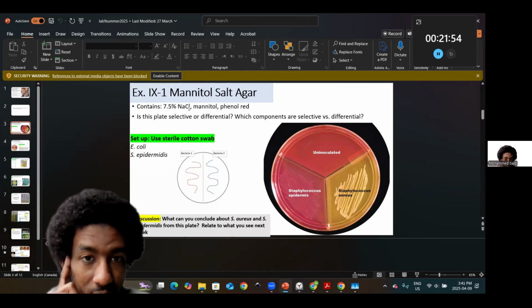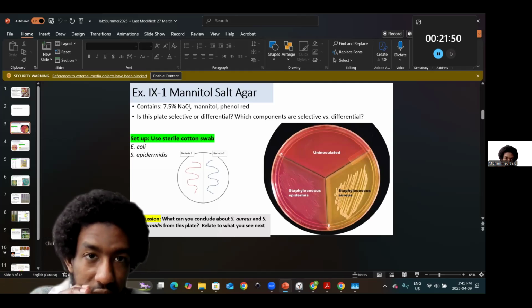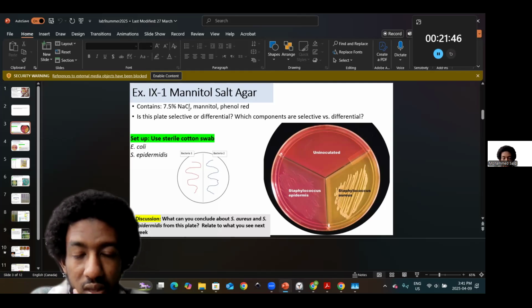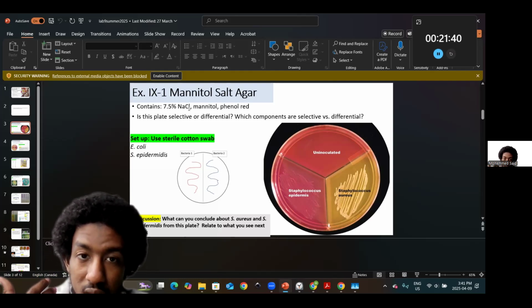I want you to think about that because that already gives you a hint with the extremities that we've talked about from our previous week reviews, for week 8, week 7, or even week 6. So think about these concepts. And then fermentation, mannitol, it's going to be metabolized.